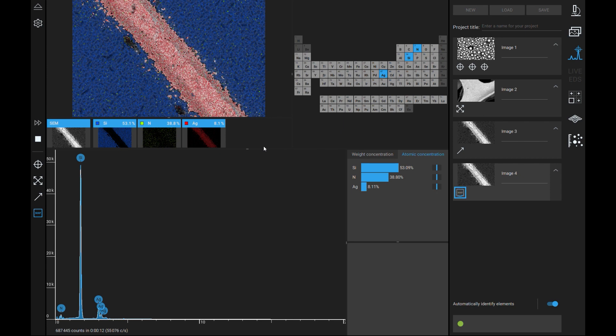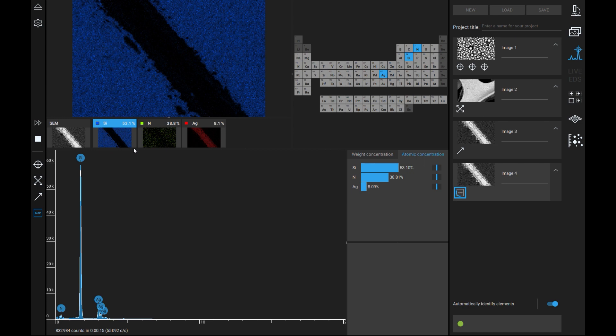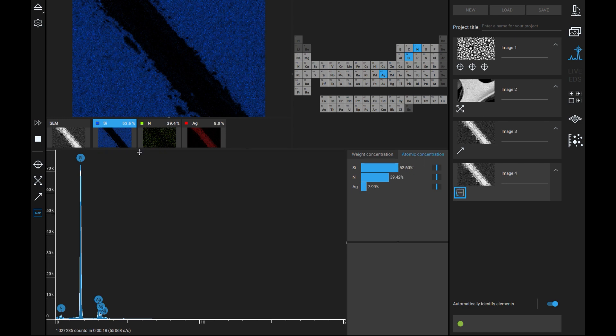Maps of individual elements can be viewed by left clicking the associated map. Multiple maps can be overlaid one another by holding control and left clicking several maps.